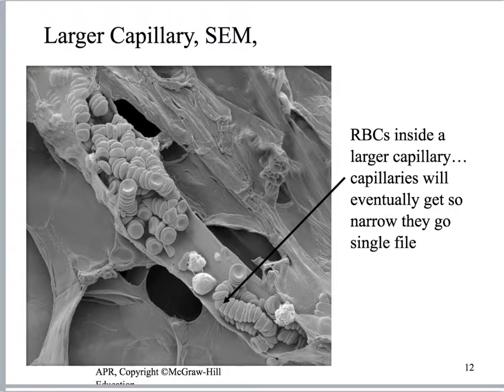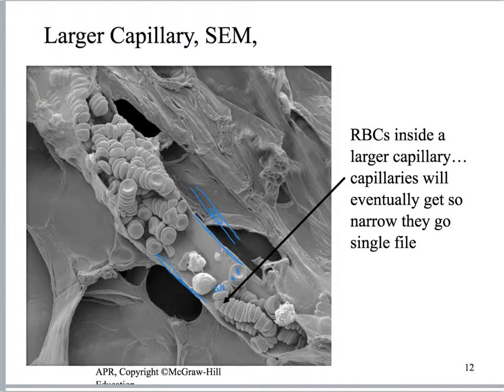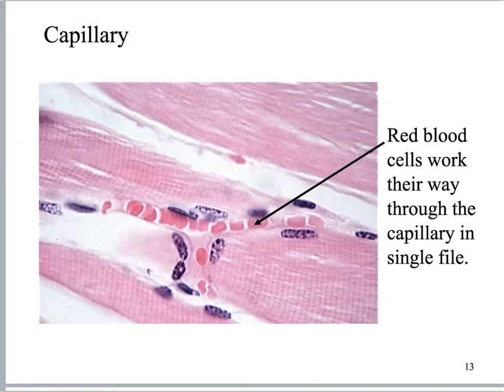Here's a large capillary where you can see all the little red blood cells going through it. Eventually some capillaries get really narrow — only as wide as a single red blood cell — and the red blood cells actually need to become kind of torpedo-shaped. Here is a nice example of a small capillary where the red blood cells are going through single file and have taken on more of a torpedo shape.